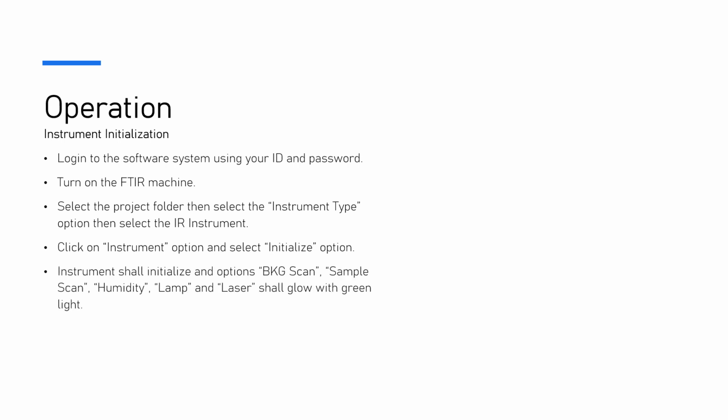Then the instrument shall initialize, and options like background scan, sample scan, humidity, lamp and laser shall glow with the green light. I'm giving you an example from the LabSolutions software, which is connected with the FTIR.